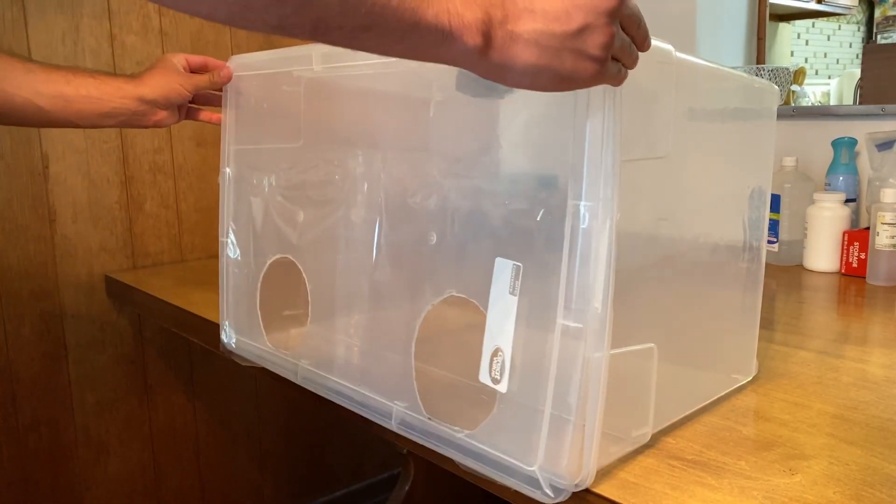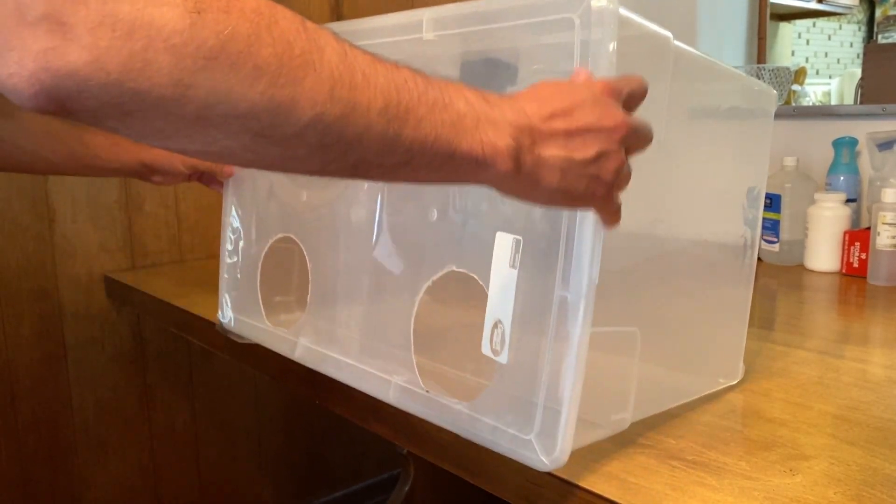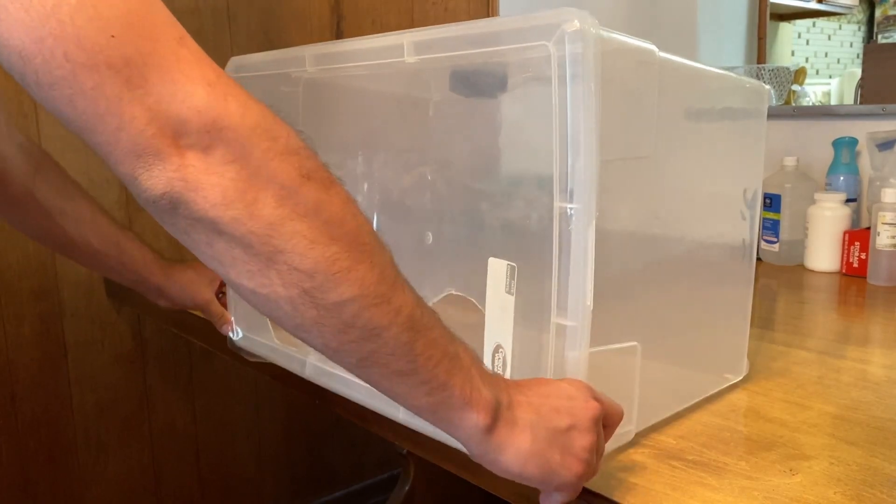First off, you'll need a big plastic tub with a locking lid to make a still air box. There are plenty of tutorials on how to make a still air box — you basically just cut two holes in the top of the lid to fit your hands in.